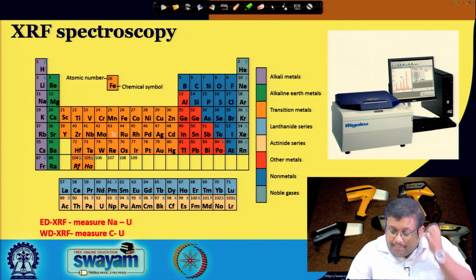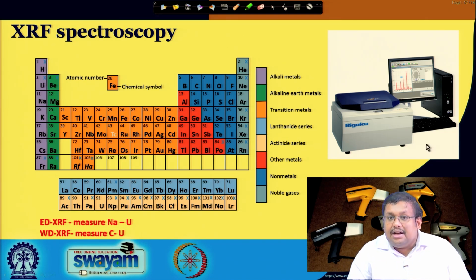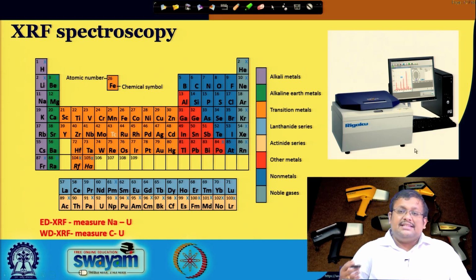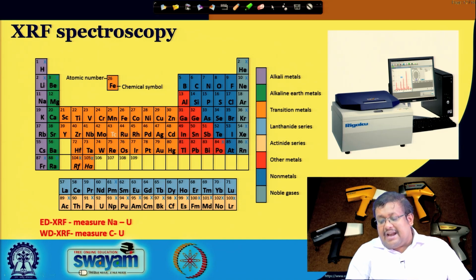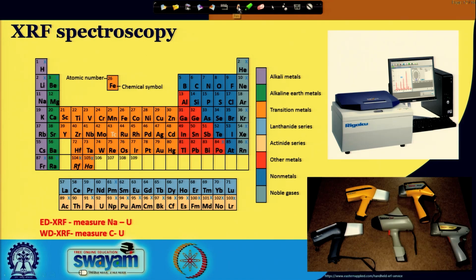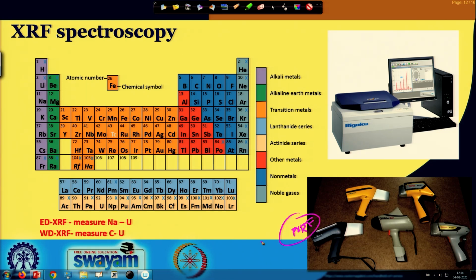So, this is a picture of a benchtop ED-XRF, and nowadays scientists have developed handheld ED-XRF instruments. We call it portable XRF or PXRF. So, these are called portable XRF or PXRF instruments, which use the same ED-XRF principle, but they are portable in nature.